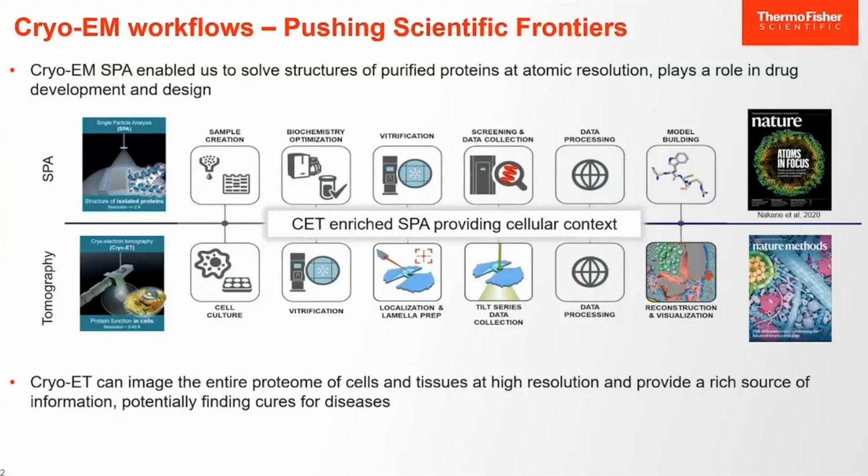The alternative and complementary workflow is tomography, where all the information that single particle actually has provided can be put and seen in the cellular context, looking at, let's say, cells, cellular fractions, and tissues.